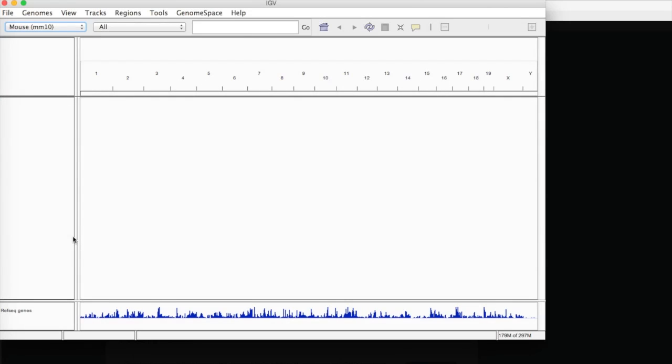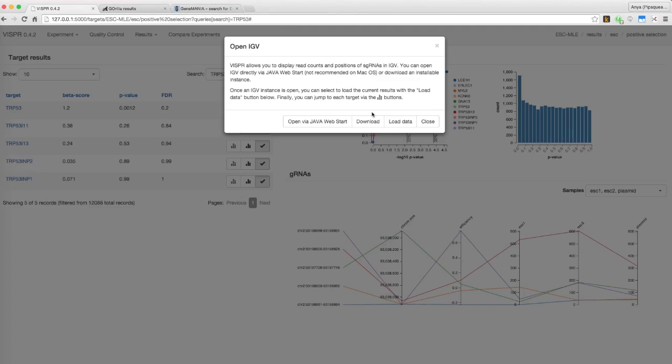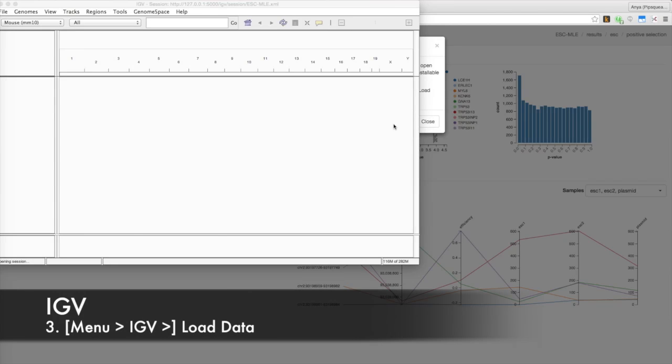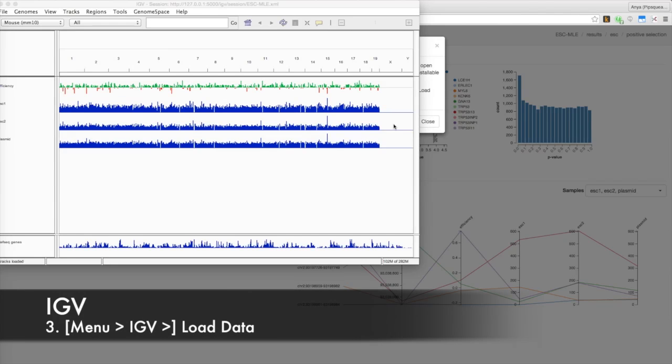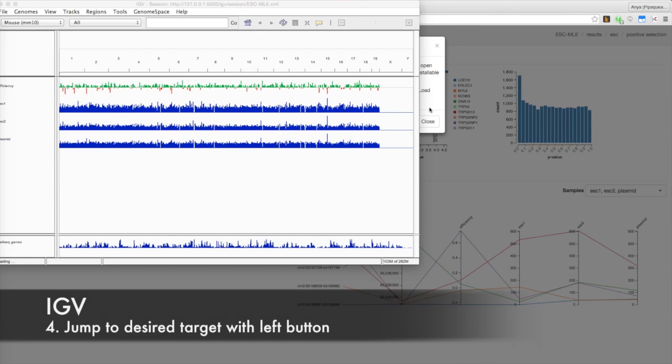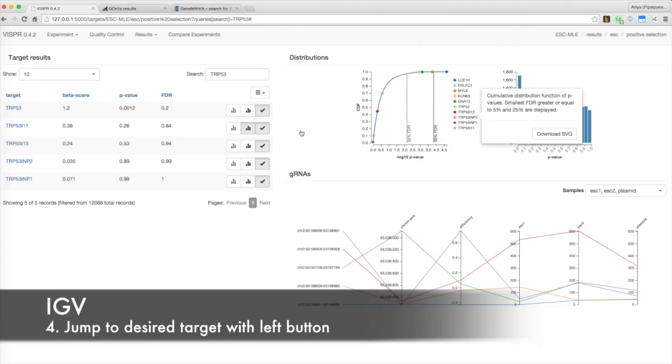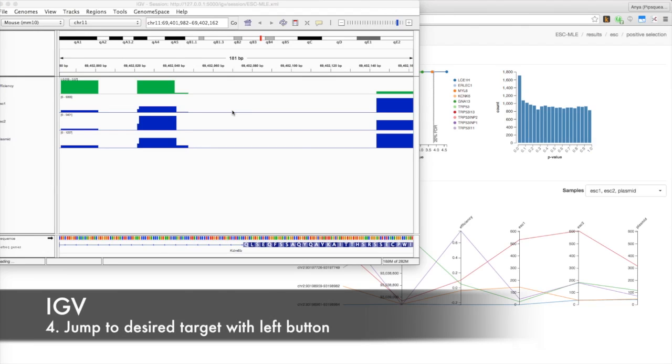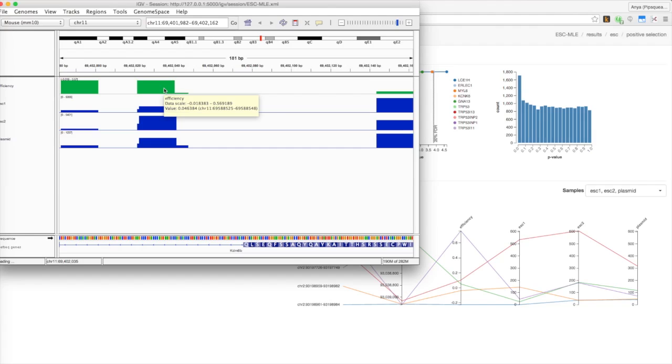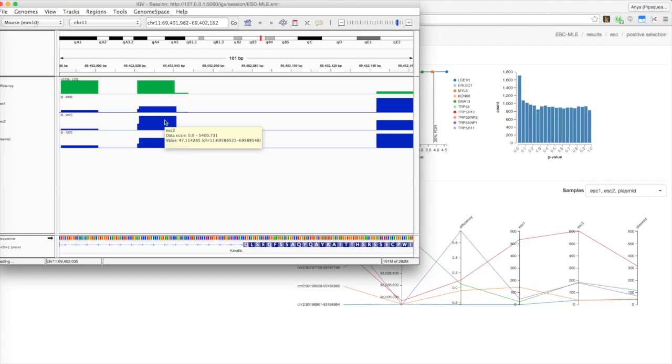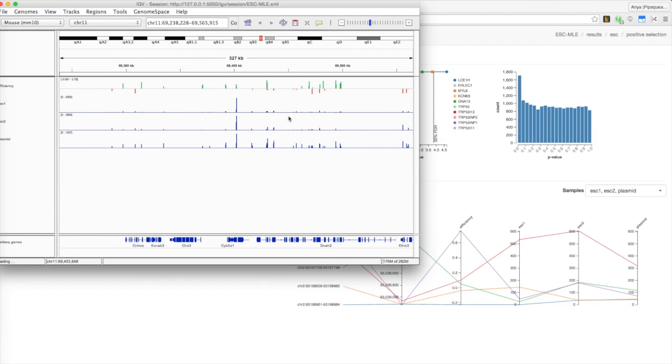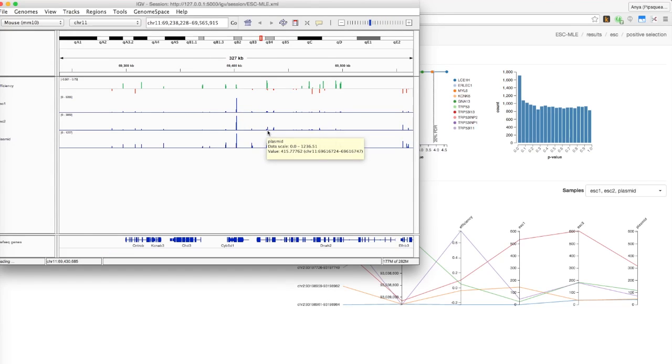Once you have an IGV window open, go back to Visper's IGV menu and click Load Data. Wait until bars appear. Then, you can jump to each target via the leftmost buttons on Visper. IGV will show you where each target is located on the chromosome. You can hover over the bars to see the sgRNAs they represent as well as their read count values. For more information, see the IGV documentation linked below.